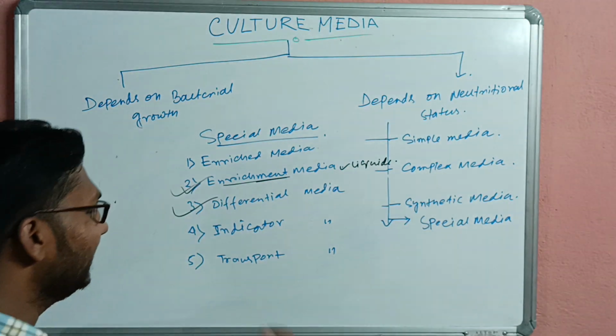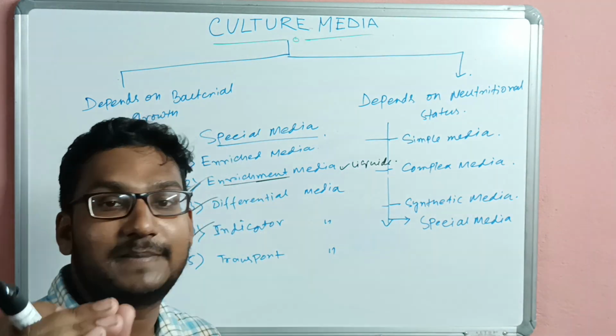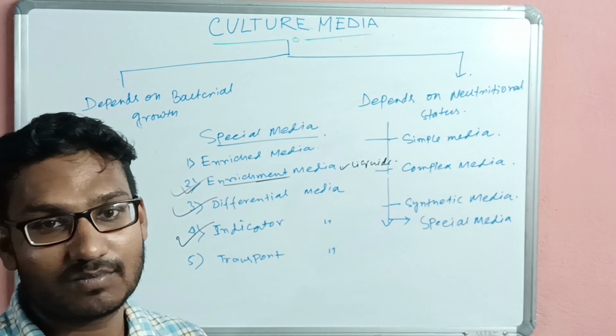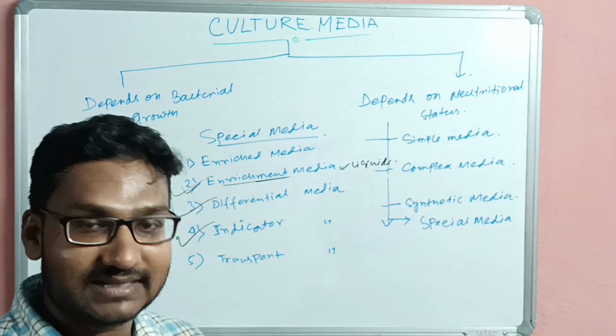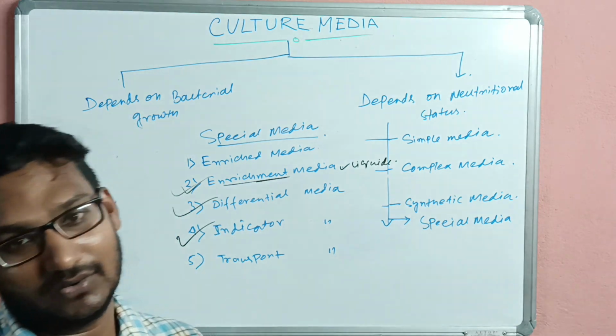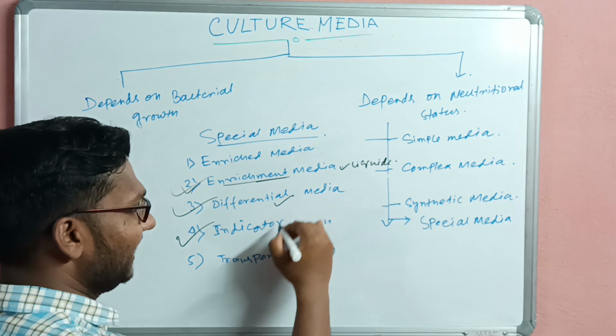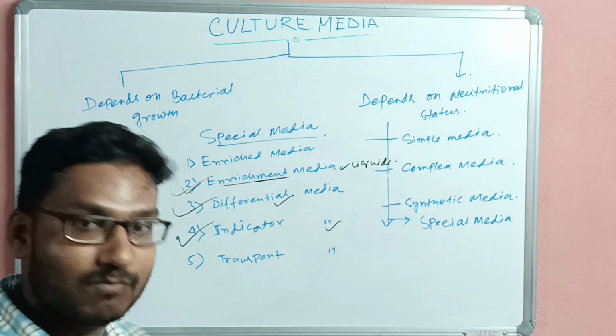Clear? Indicator media is the same. A special indicator is present which can differentiate lactose and non-lactose fermentative bacteria. So it is also called the differential media and also called the indicator media.